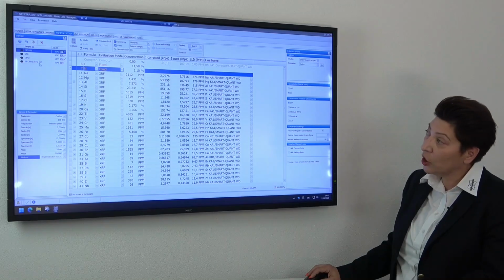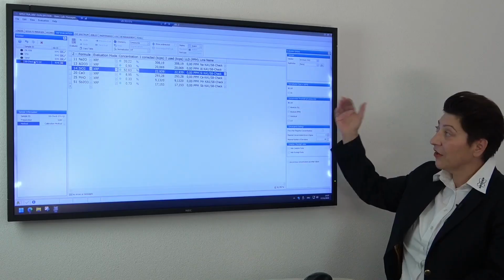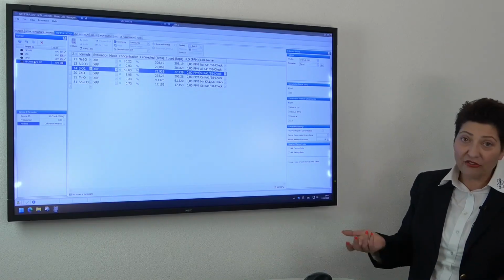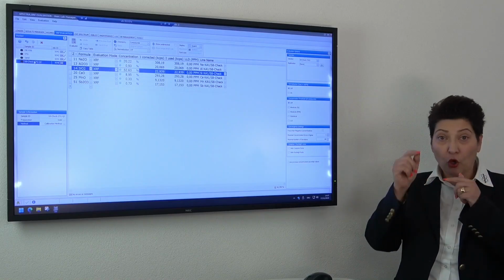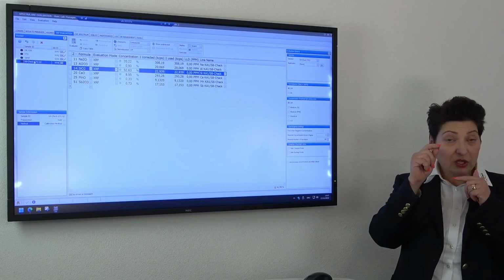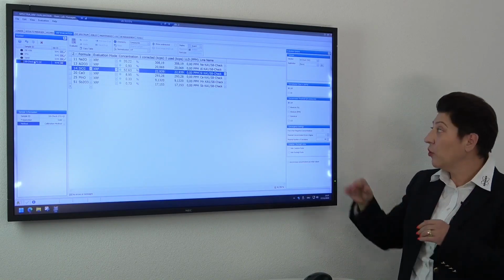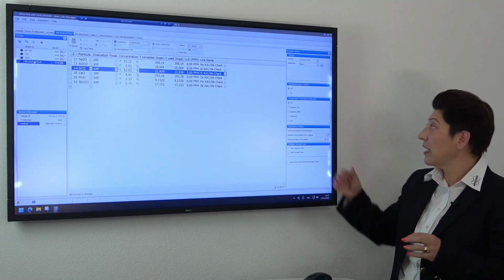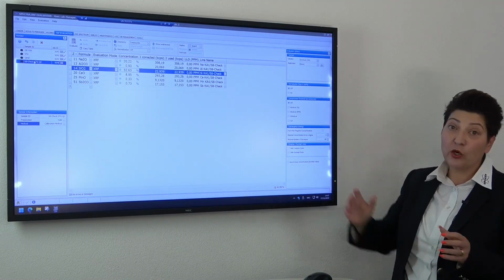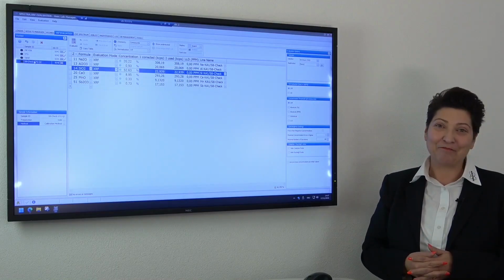You can have a closer look at the results, on the intensities. You can display a lot of information. You will always see the spectra of your samples. You can always make sure that this is really a peak, or maybe this is a false positive element. So therefore, you can do a lot of optimization by re-evaluating the sample, or maybe changing some evaluation options to make the proper fit for your standardless method.